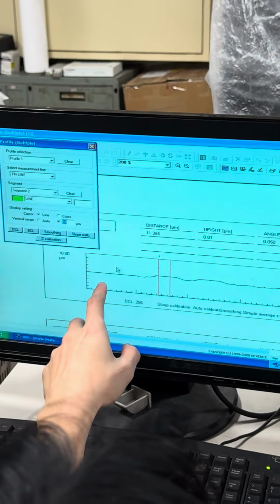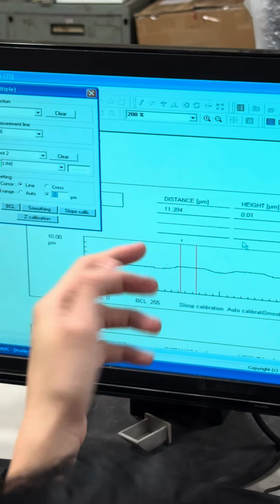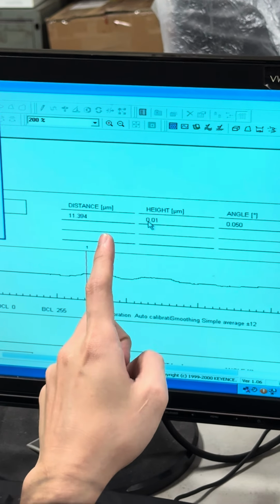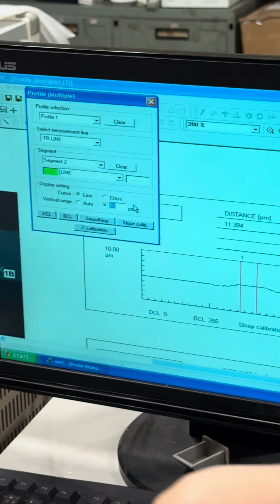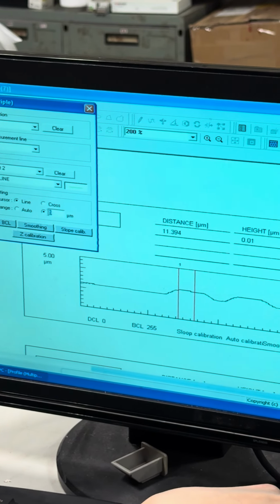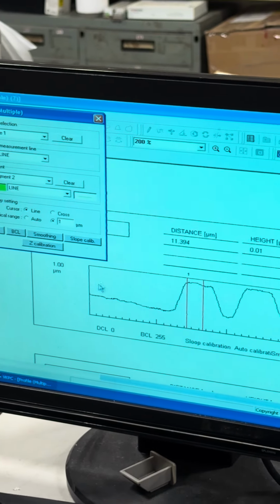Now you will see that it becomes flat because we have scaled down everything 8 times. Right, see that our last value is somewhere around 0.08, but now we set it back to 0.01, so everything is scaled down 8 times. So you might want to change your vertical range to see it more clearly. Make it 2, okay, or even 1. Yeah.